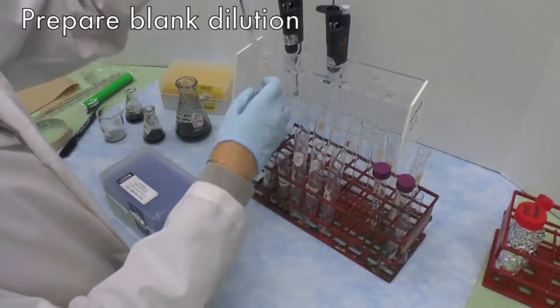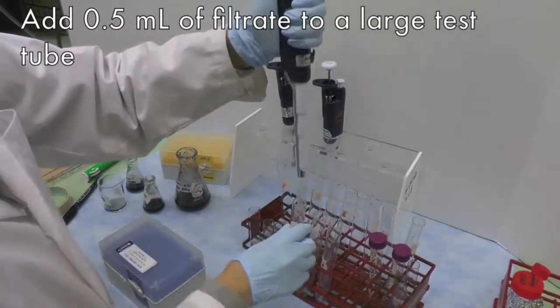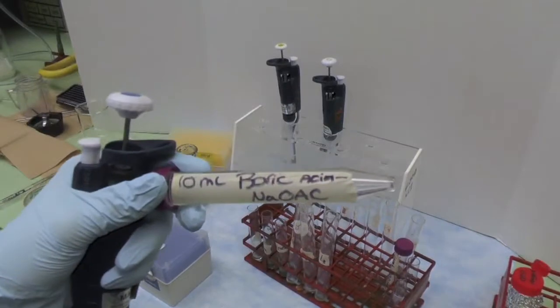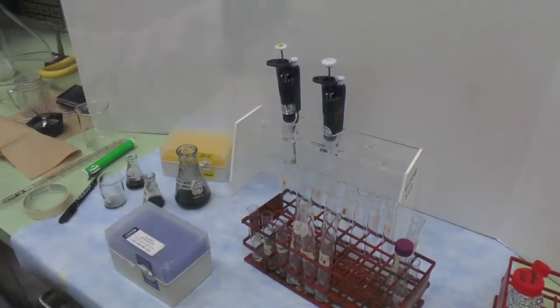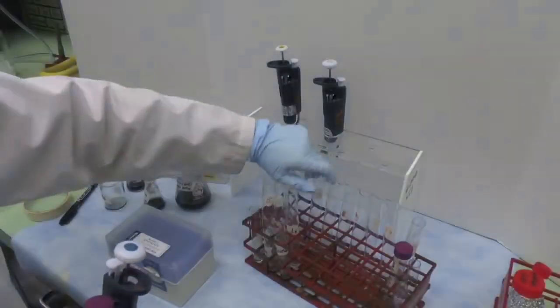To prepare the blank dilution, pipette 0.50 ml of each filtrate into a separate large test tube. Label clearly. Then add 0.50 ml of boric acid in sodium acetate solution into each of the large test tube. Wait for 10 minutes and vortex every 2 minutes.